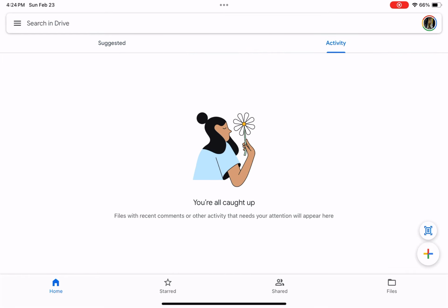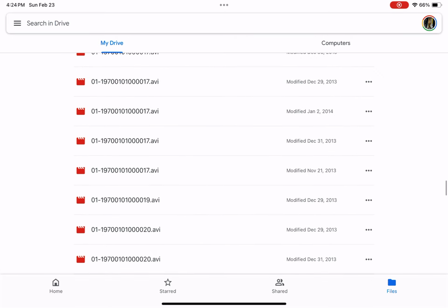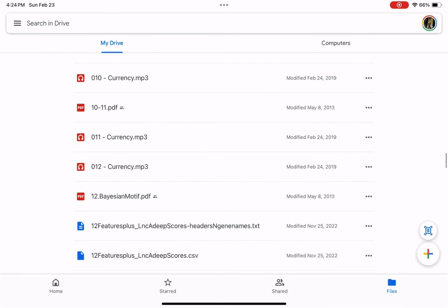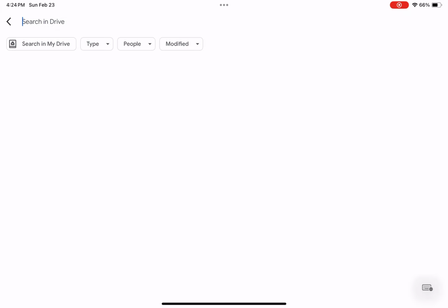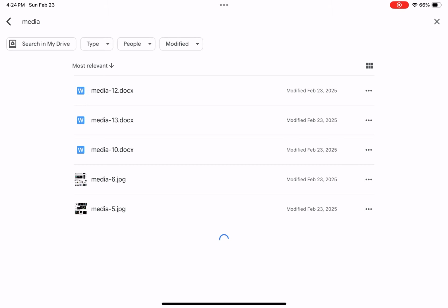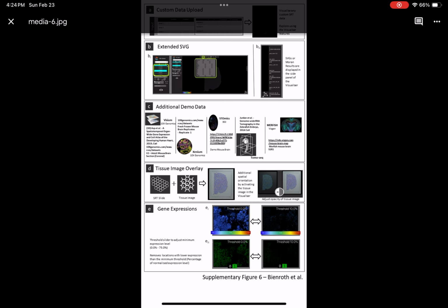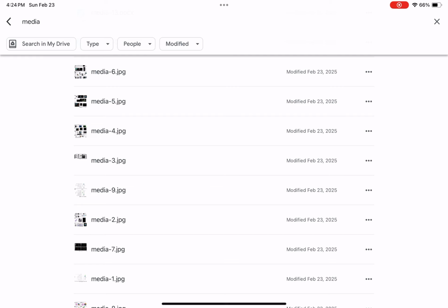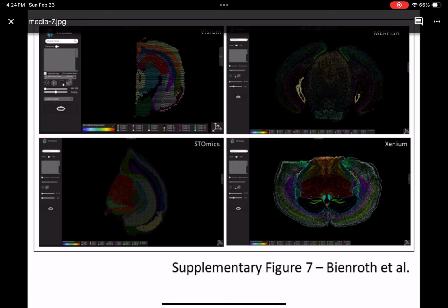A. STAGATE labeled clusters using VR-Omics for analysis of MCH-TB361 sample 2. B. STAGATE labeled clusters using VR-Omics for analysis of MCH-TB361 sample 3. C. STAGATE labeled clusters using VR-Omics for analysis of MCH-TB361 sample 1. D. BayesSpace joint clustering of multi-slice, co-planar MCH-TB302 dataset used for orthogonal validation of results generated within VR-Omics. E. STAGATE labeled clusters using VR-Omics of multi-slice, co-planar MCH-TB362 sample 2.